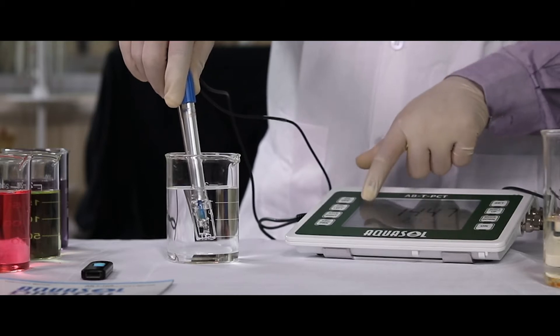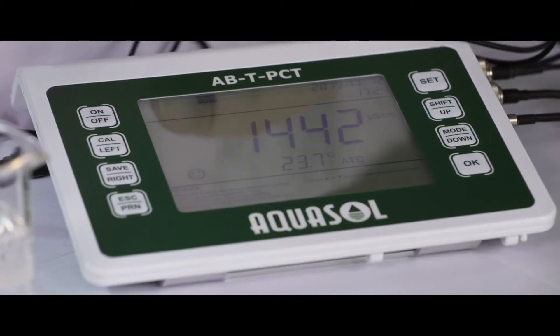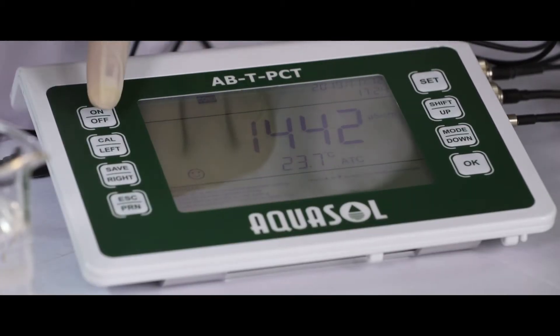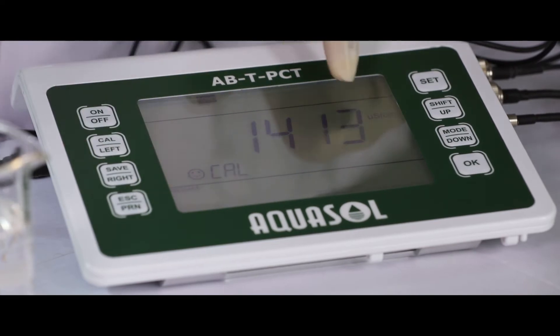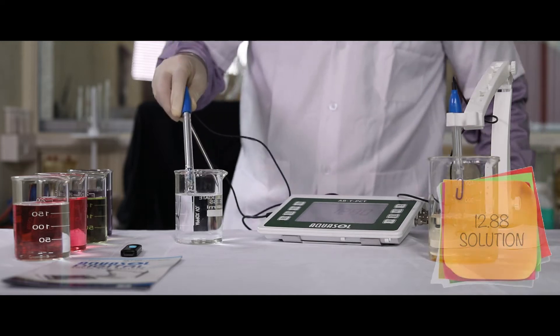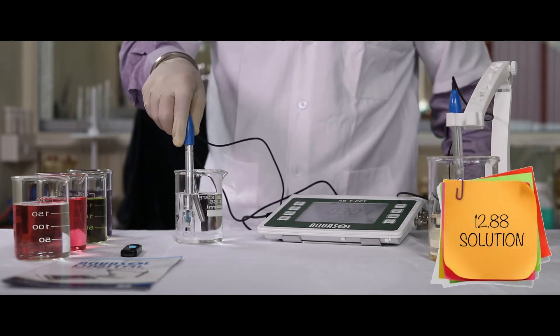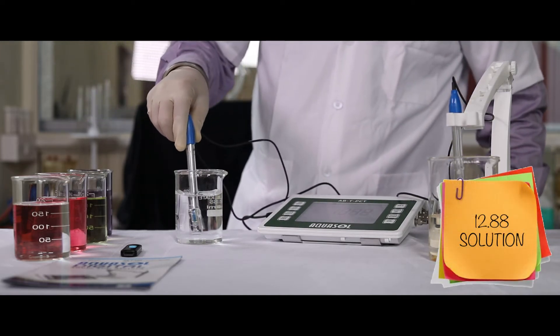Once the reading is stable, a smiley emoji will appear on the display. Press CAL key to start calibration and then press OK to calibrate. Repeat the same procedure for 12.88 buffer solution and then press OK.